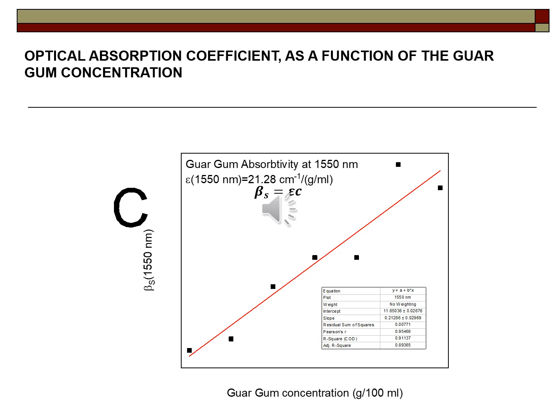It's evident here the linear behavior, showing that the Beer-Lambert model applies at this range of concentrations, no matter the high scattering characteristics of these colloidal suspensions. It's worth advising that this kind of linear correlation is not possible to be obtained for the absorbance measured by means of a conventional spectrometer.